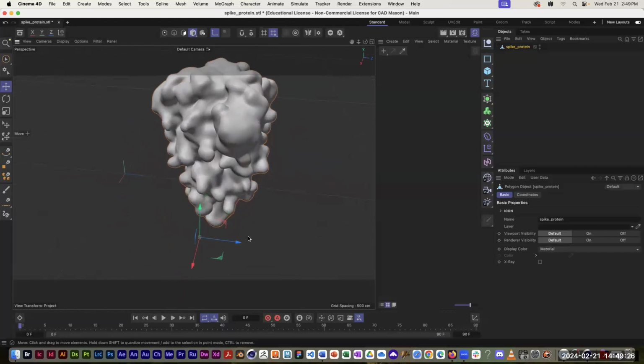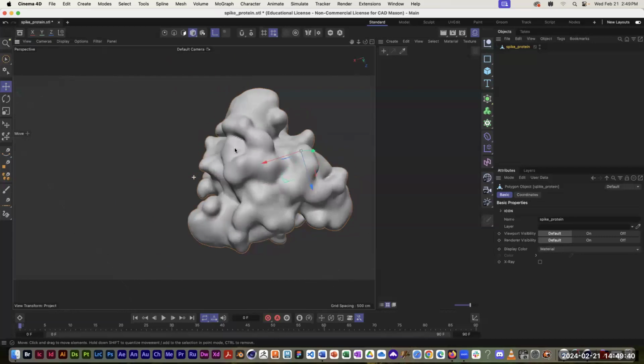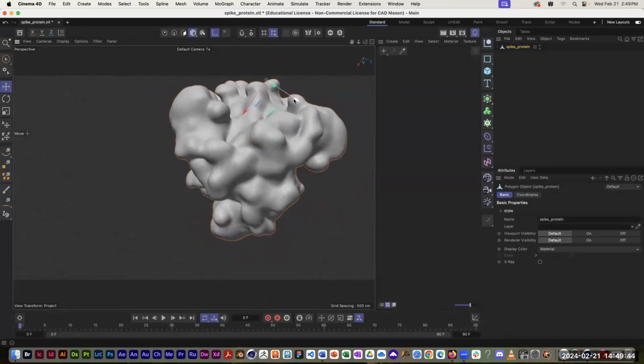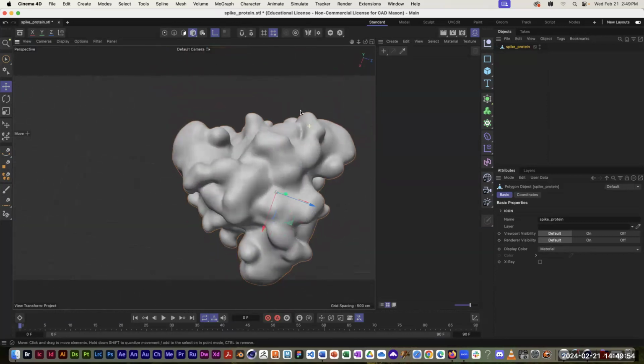Another way I could do this is open up 4 windows at a time so I could see it from the front, back, top, left, right, etc. at the same time. But you do typically have to move these things around quite a few times. It's surprising, you look at it one way and you're sure it's right smack in the middle, but then you move it again and you realize it's actually not right in the middle.